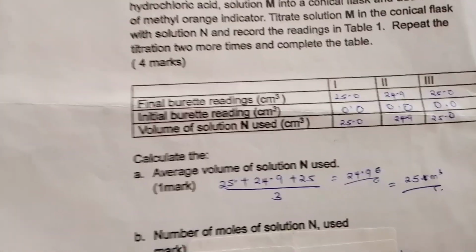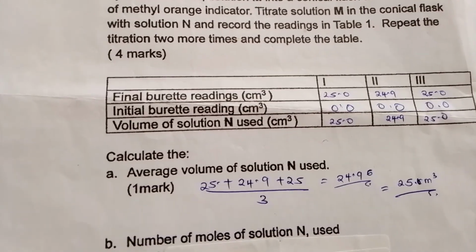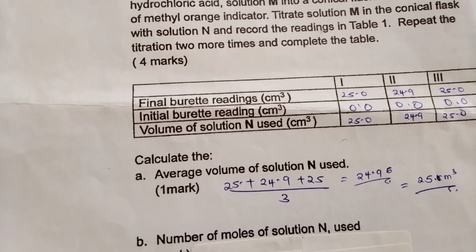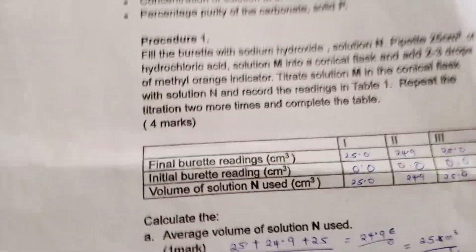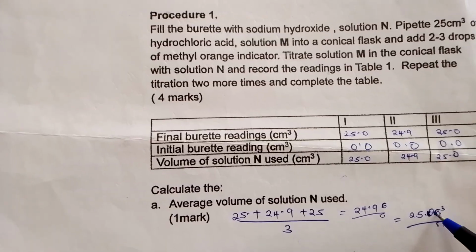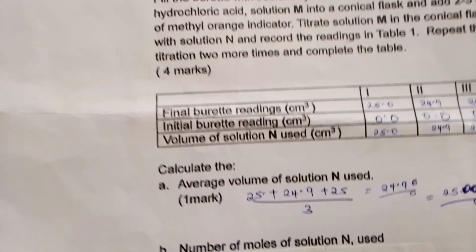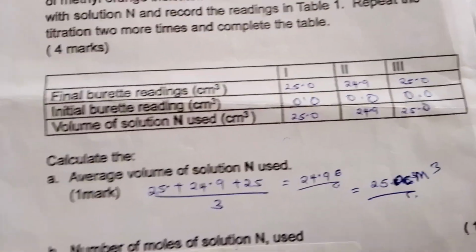That is the average volume, 25.0 cubic centimeters. Let me just put it clear so that you can see. That is 25.0 cubic centimeters.